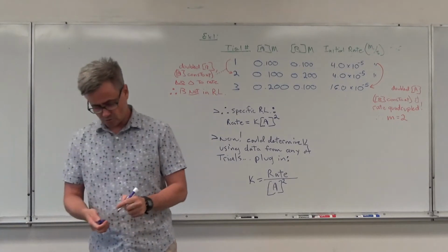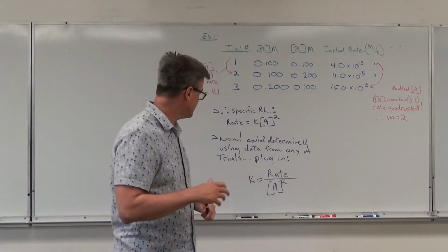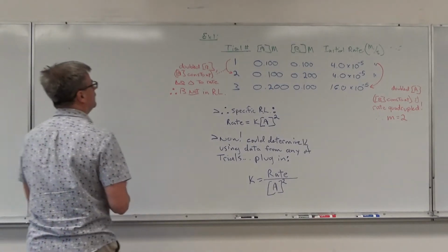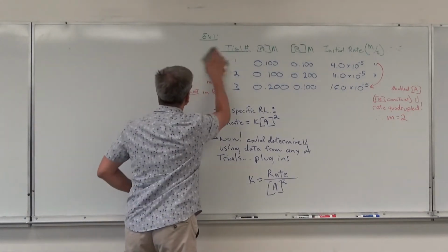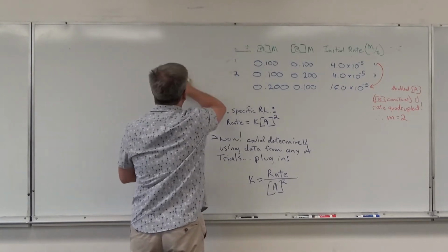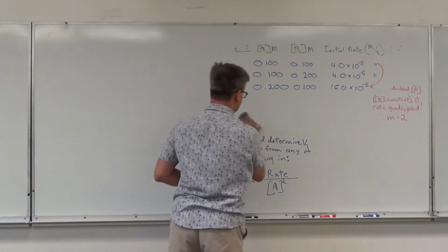All right. So I'm going to talk now about the specific reaction that we're doing, which is the decomposition of hydrogen peroxide in the presence of potassium iodide.